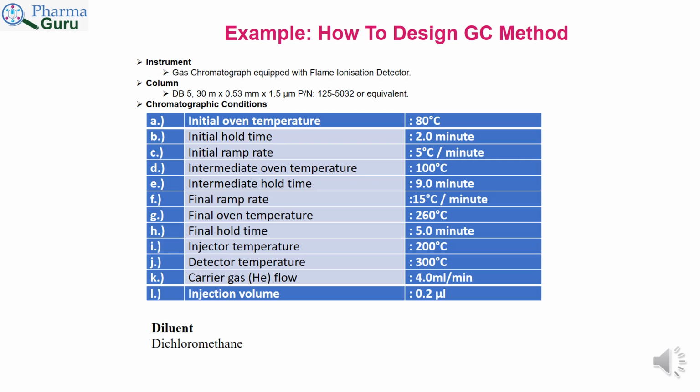case study of a new method. Instrument, it must contain gas chromatograph equipped with flame ionization detector or any other detector as per application.